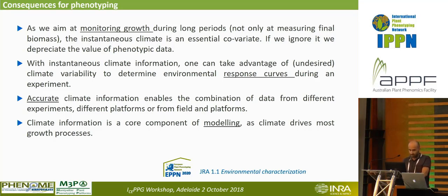The second point is that we can use this instantaneous information for performing plant response curves to these environmental conditions. Third point is that we can use this accurate climate information for enabling the combination of data from different experiments, different platforms, and from platform to the field. And the fourth point is that climate information is a core component of modeling, as it drives most of growth processes.